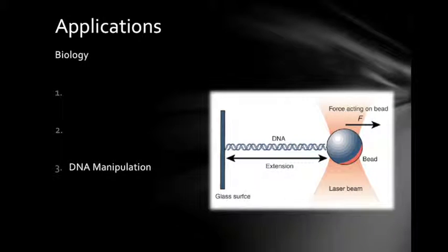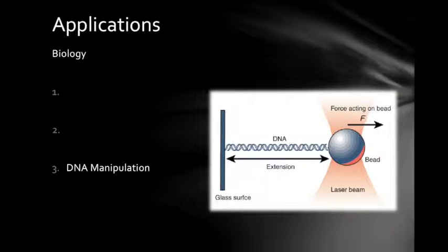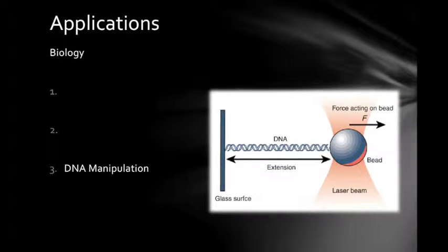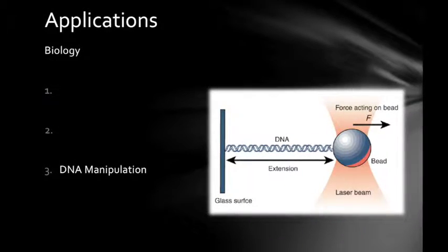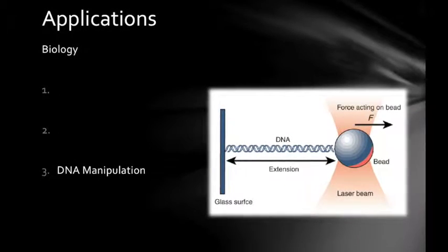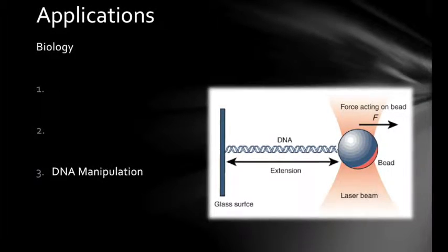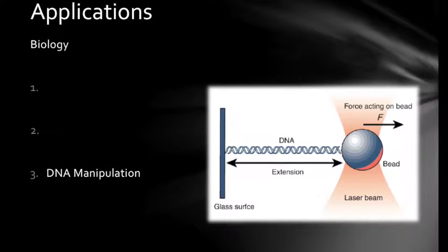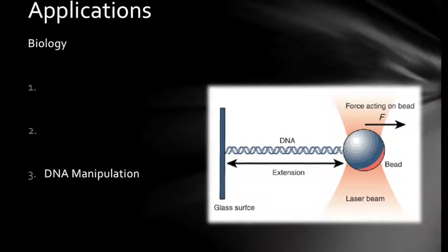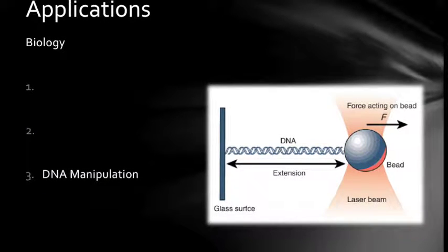The translocation, or rearrangement, of DNA molecules is an integral process for the functioning of living cells. Many of the basic physical, chemical, and biological interactions have not yet been studied because they are not directly experimentally accessible. Scientists have shown that the combination of optical tweezers, single solid-state nanopores, and electrophysiological ionic current detection enable deeper insight into the behavior of DNA molecules.